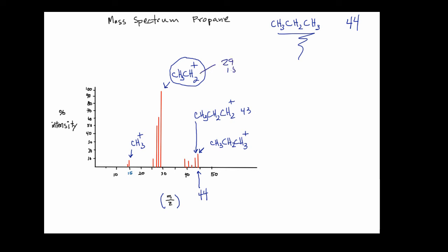And if we add 15 to that, we get back the molar mass of the entire compound. So when this thing enters the stream of electrons, you're going to see one of the major cleavages is here. That electron stream is actually breaking a bond between this end CH3 and then the rest of the molecule.